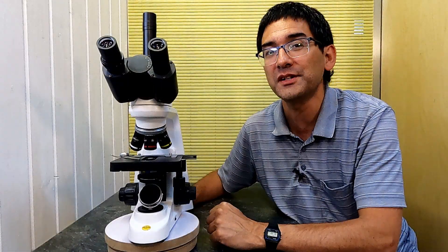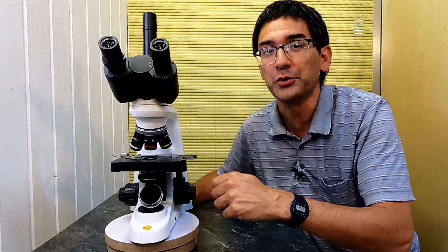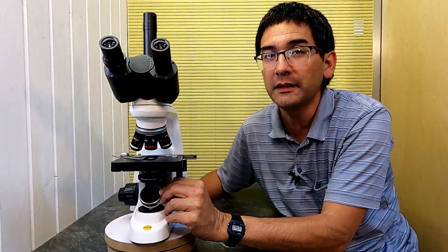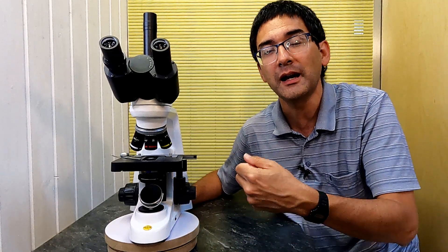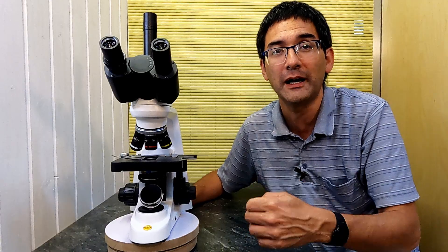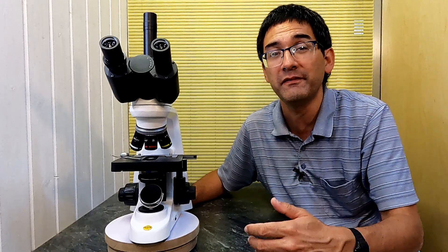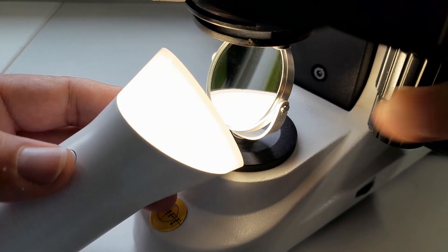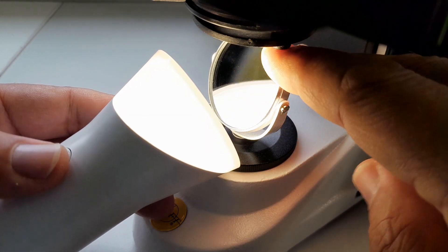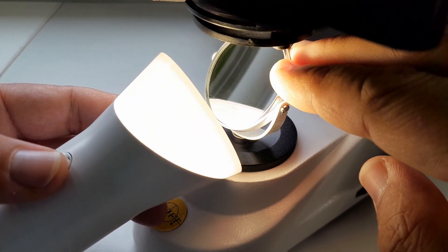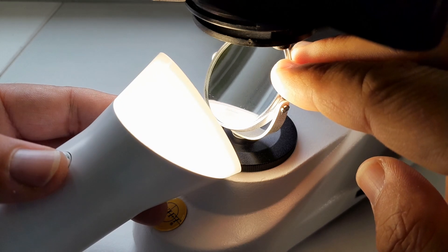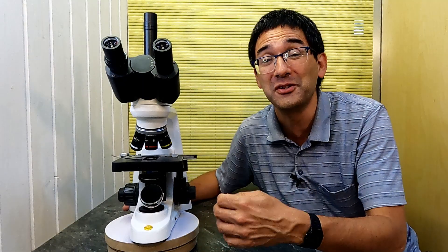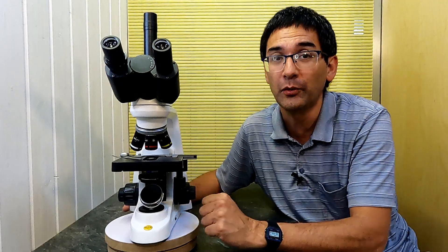But besides that, what are some other possibilities or options? Well, first of all, a mirror does allow you to use a more highly intense light. So if you have an external light source, or maybe a very strong flashlight, then of course this means that you have much more light available. For example, for photography work or for video where you can always use more light. So this is one advantage.